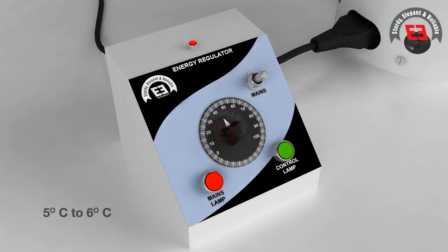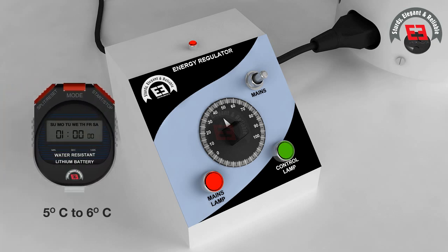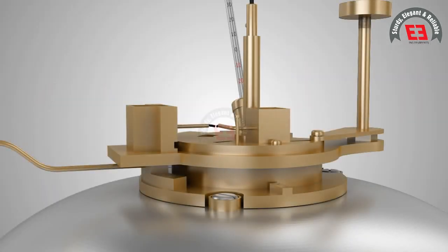The rate of heating is adjusted to 5 to 6 degrees Celsius per minute. The test flame is adjusted to a size of 4 mm bead.